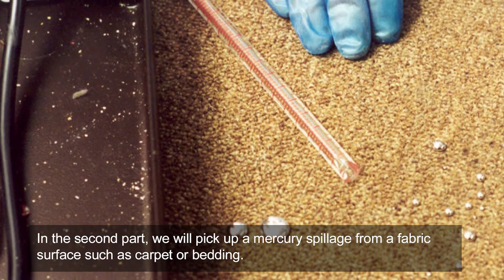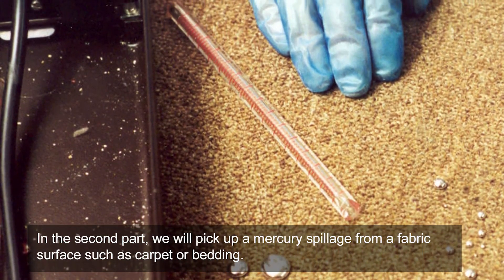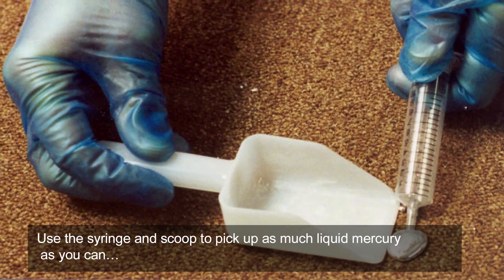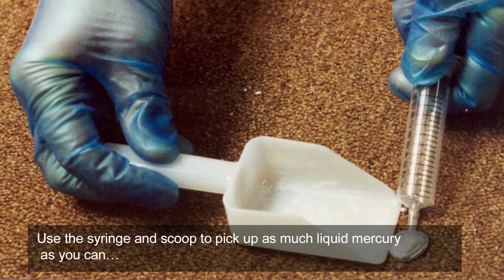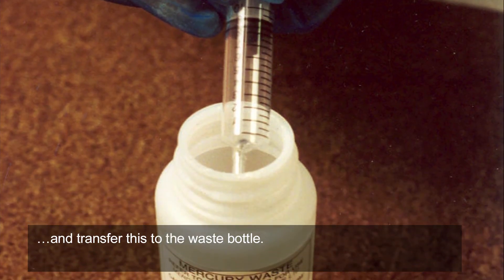In the second part, we will pick up a mercury spillage from a fabric surface such as carpet or bedding. Use the syringe and scoop to pick up as much liquid mercury as you can, and transfer this to the waste bottle.